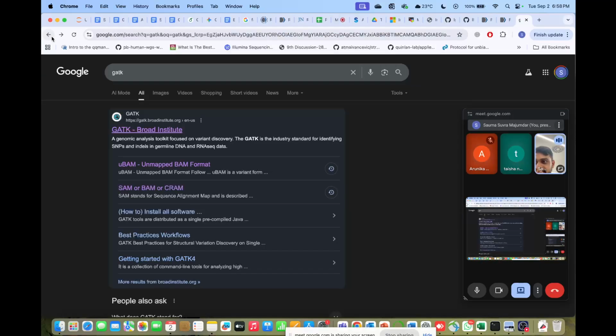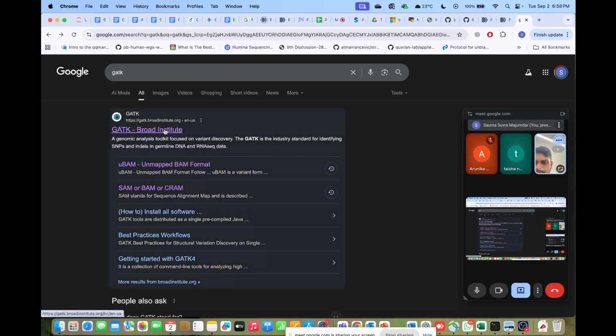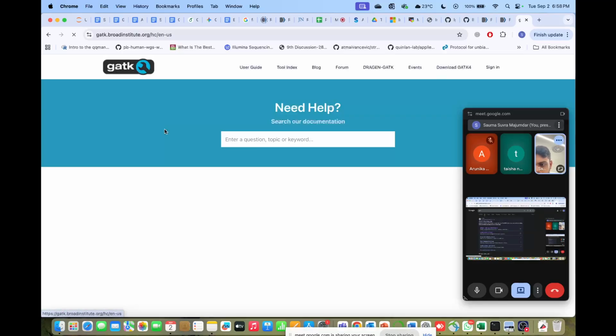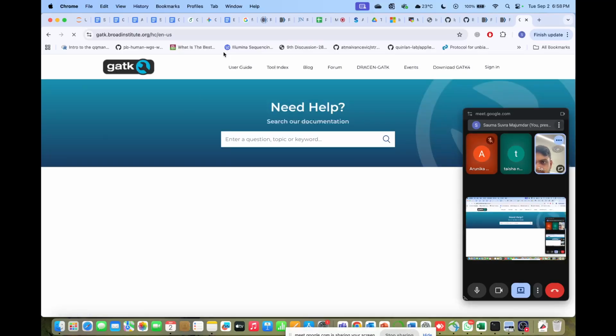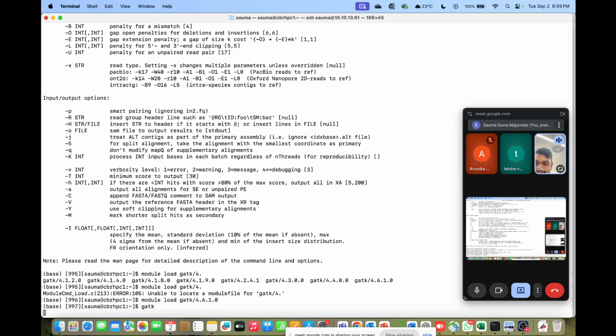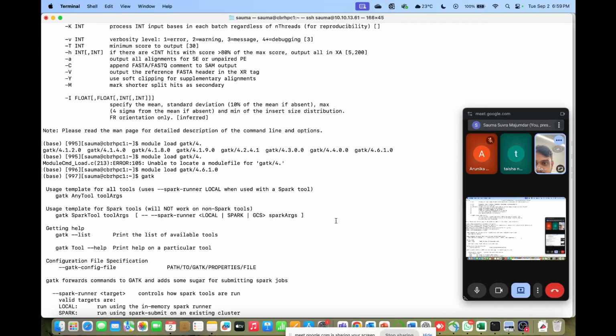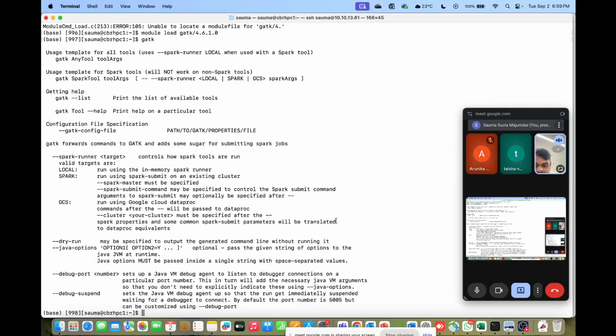I don't think this is opening. Excuse me. Oh, let me show you in the terminal only. So if I do GATK, I think one second.